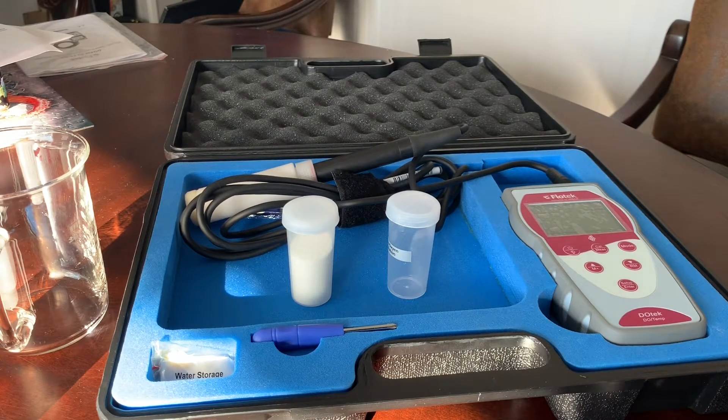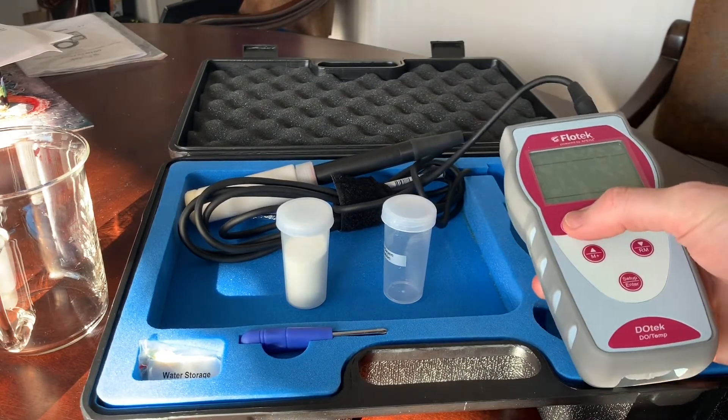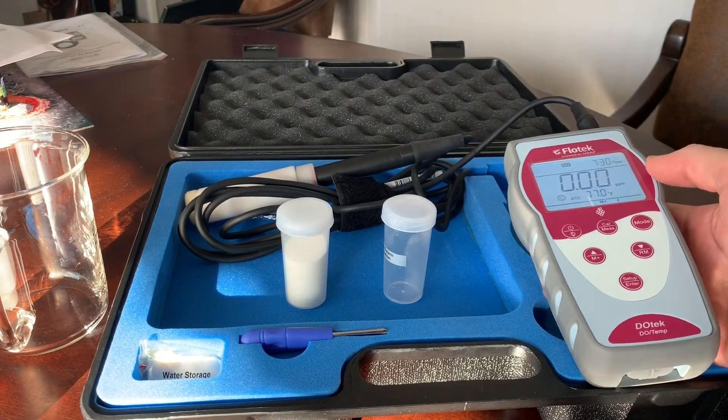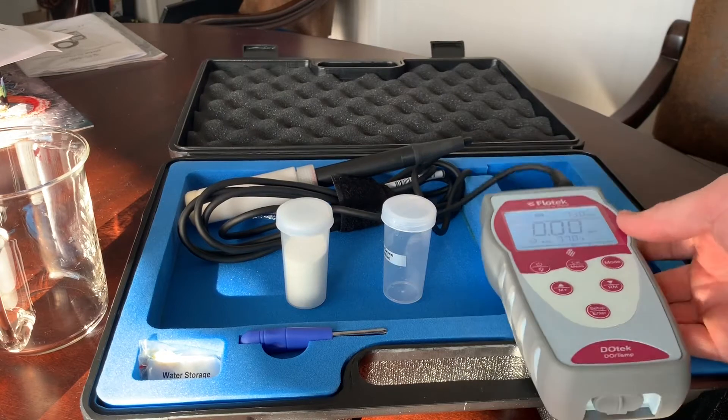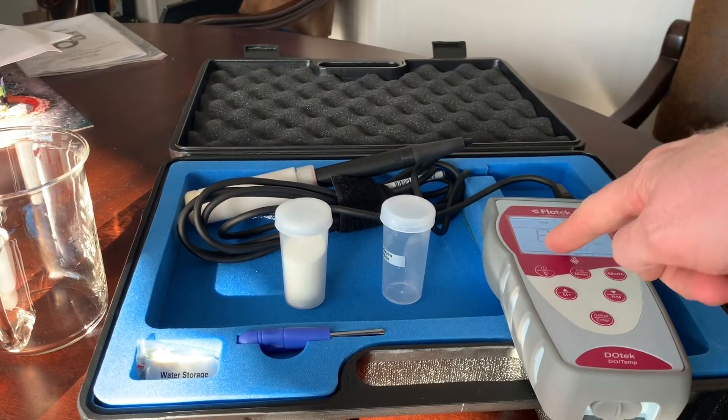I'm going to show you guys how to calibrate our FLOTech handheld dissolved oxygen sensor, the DO-TECH. First step is to turn it on and let it warm up for just a second. You'll see this number be zero. Once it starts measuring, you'll see a number here.